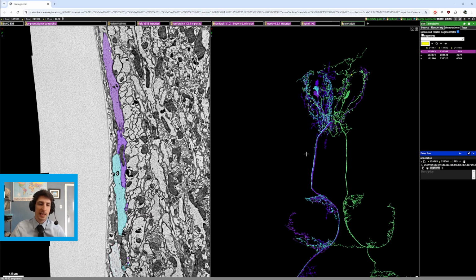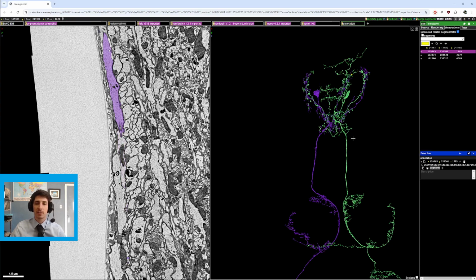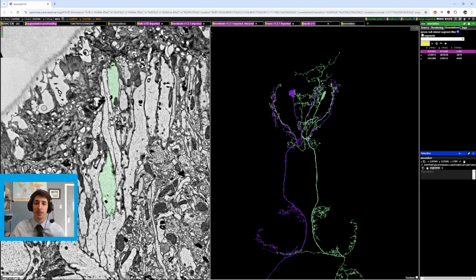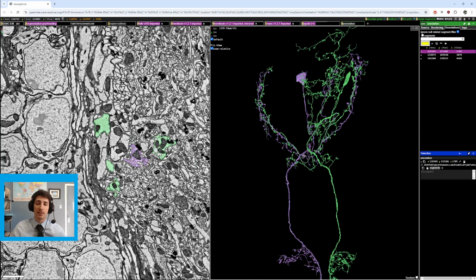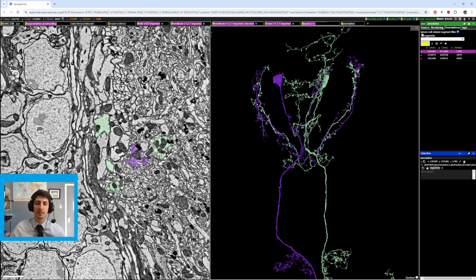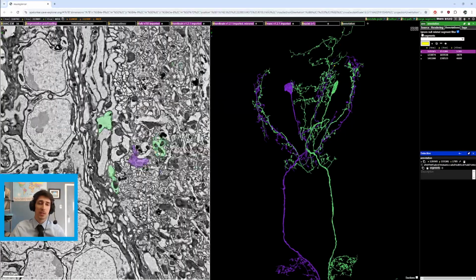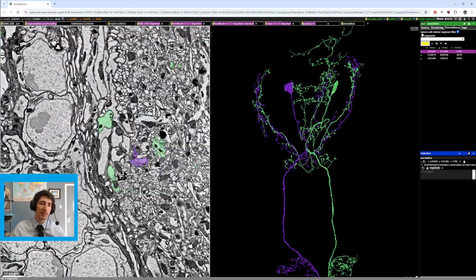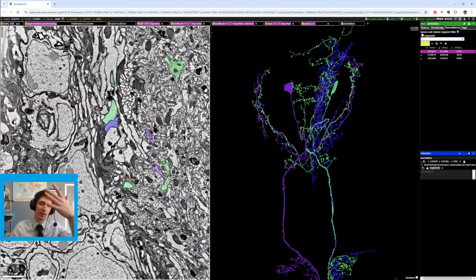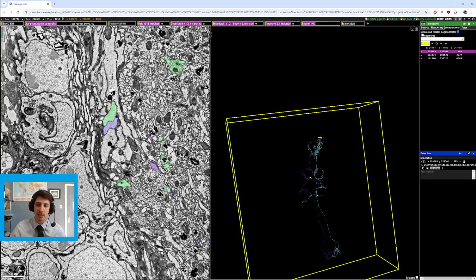I don't know if they're exactly the same, but that is how you're sometimes going to be able to find a similar cell, unless it's a singleton cell and there's only one of those on either side of the brain. But there are other ways to find similar looking cells. That is the typical way. Just click around like this here. You can see the flow is kind of similar. That might give you an idea that, yeah, that looks kind of similar.